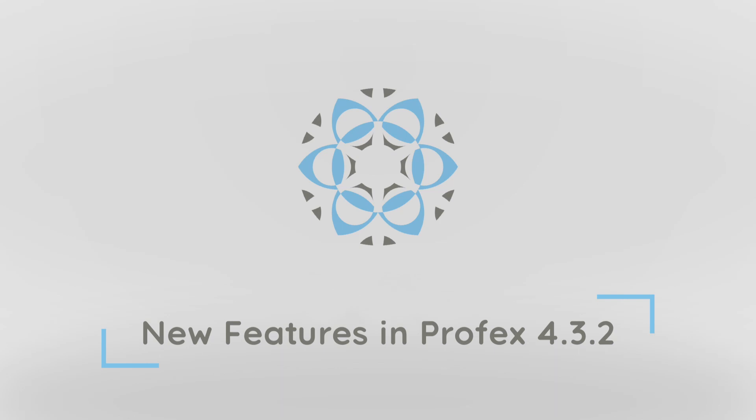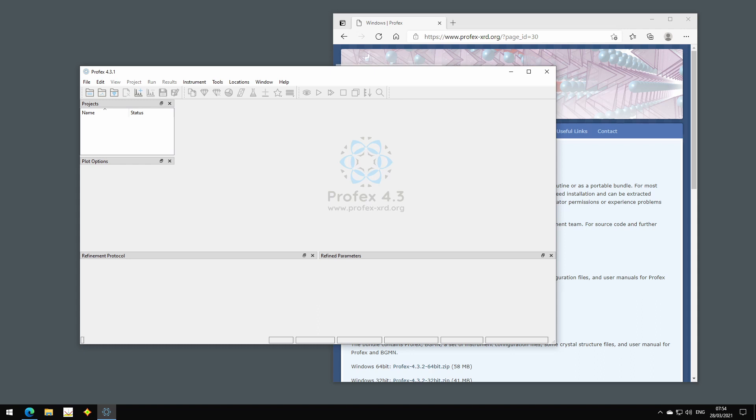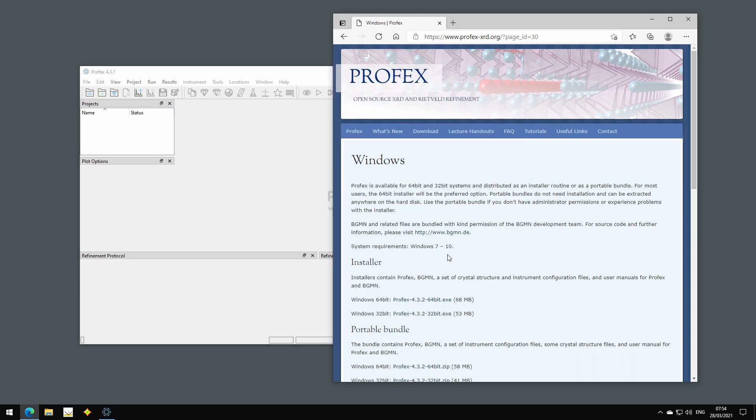At the beginning of the video I will also show you how to upgrade to this version on Windows, because I added a new and more convenient upgrade mechanism. The new upgrade mechanism was introduced with version 4.3.1, so it only works if you installed this version with the installer package from the Profex website, but not if you installed it with the portable bundle.